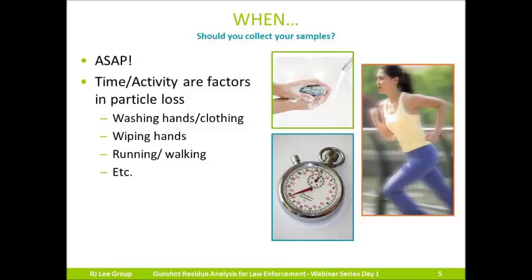There are some labs out there that have what are called cutoff times. For example, if a suspected shooter isn't apprehended and samples aren't collected before a certain hourly time frame of a shooting incident, some labs will not accept the samples for analysis. This is because there are several factors, such as running, weather, and activity, that can cause particulate loss.